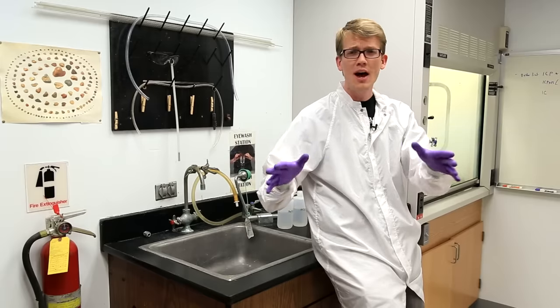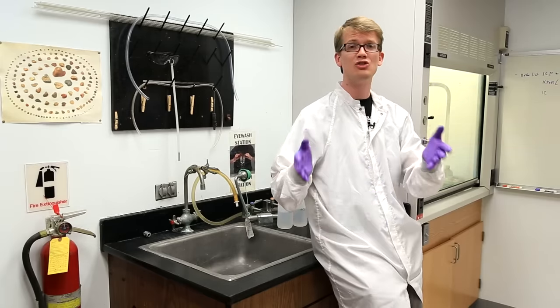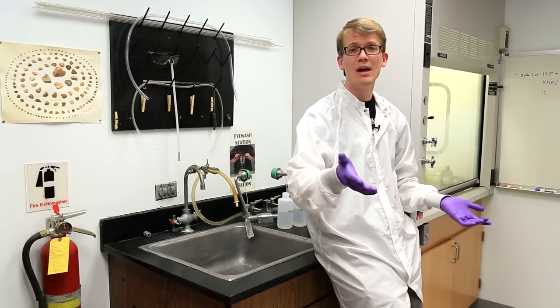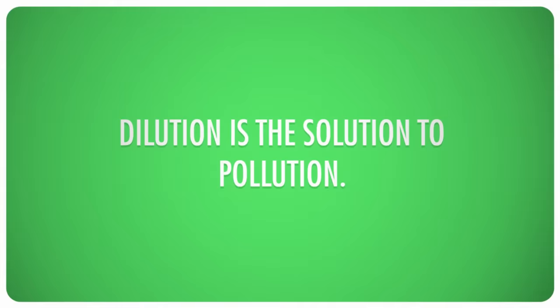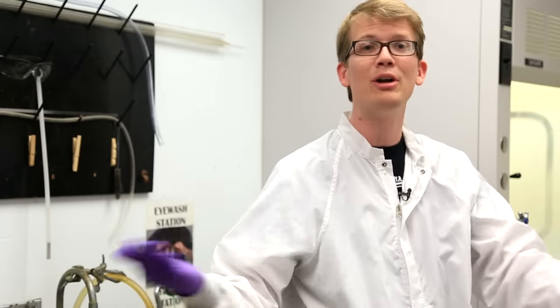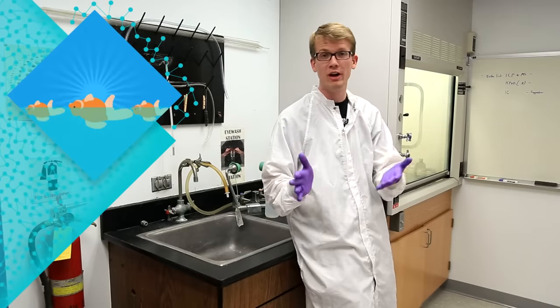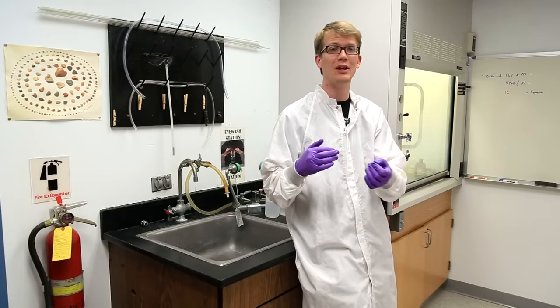When you're done with an experiment, do not just dump the results into the sink unless this has been explicitly approved by the person in charge of chemical safety. For some chemicals, like common acids or bases, dilution is the solution to pollution. When they get diluted, all that's left is common ions like chloride ions from HCL or sodium ions from sodium hydroxide, in addition to some protons or hydroxide ions that are neutralized by buffer ions that are present in your sewage system anyway. Bottom line is, they can be flushed with lots of water. For other chemicals, flushing is not a good idea. That probably won't hurt you, but it might hurt the environment.